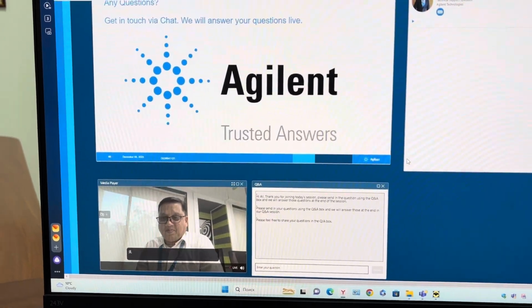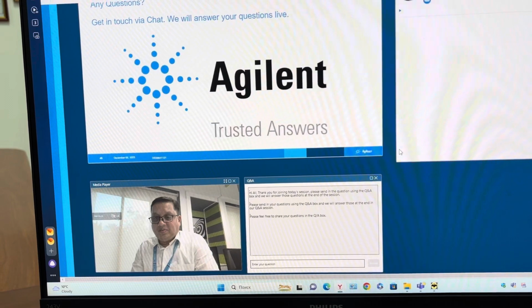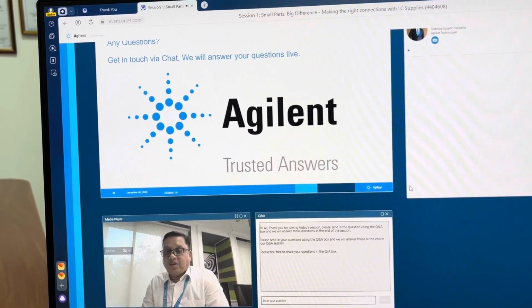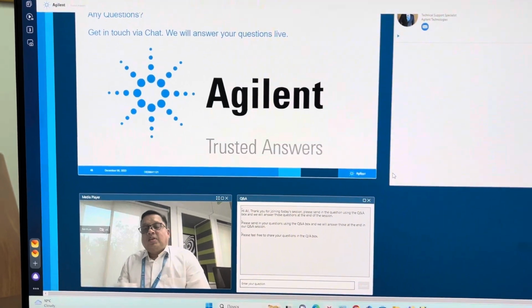I think you have covered it, Sunil. Next question is, we have these stay safe caps for the mobile phases and also for the waste cans, with these charcoal filters and all. So what is the lifetime of those filters?